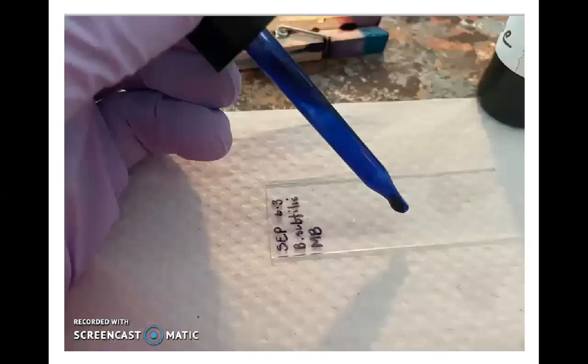Once your slide is heat fixed, it's time to apply the stain. I'm applying a drop of methylene blue, again, to the center of the slide, because I know that's where I placed my cells.